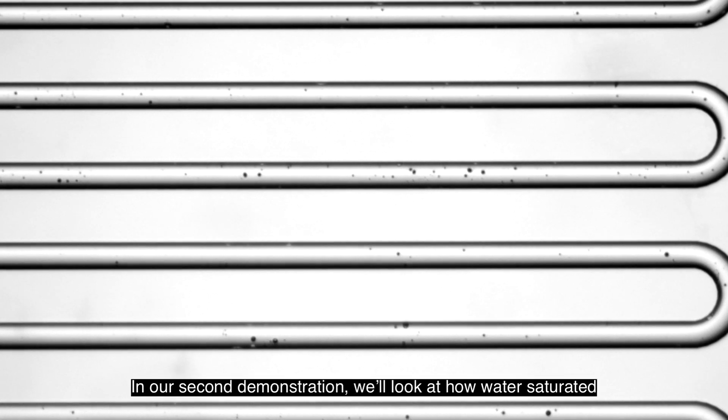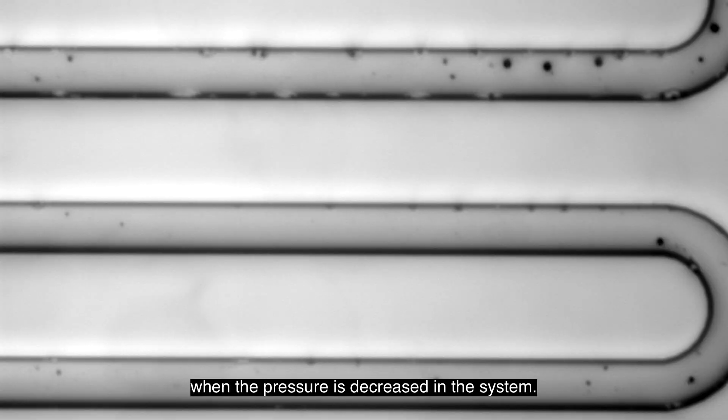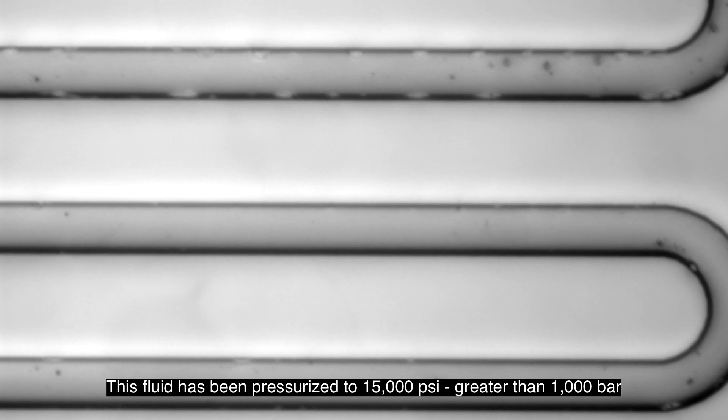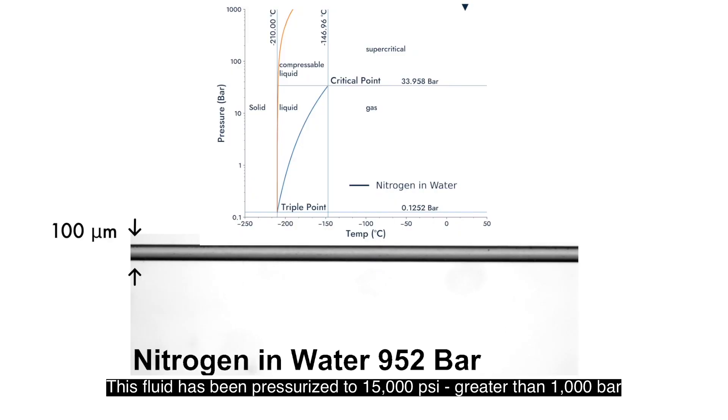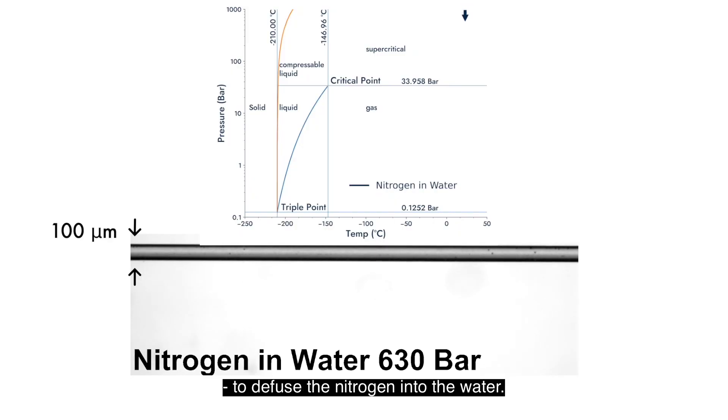In our second demonstration, we'll look at how water saturated with nitrogen reacts under extreme conditions when the pressure is decreased in the system. This fluid has been pressurized to 15,000 PSI, greater than 1,000 bar, to fuse the nitrogen into the water.